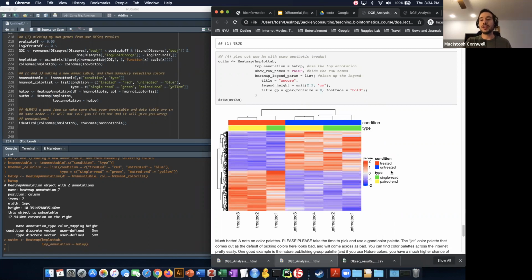So this figure will show that, one, you do have differentially expressed genes, and two, when you just let the math do its work, when you just let the clustering algorithm figure out what goes in what group based on the values in this table, it will be able to delineate out these groups, which in its essence is a basic form of machine learning, where basically it's showing that using just this data here, it can separate out into an untreated and treated group.